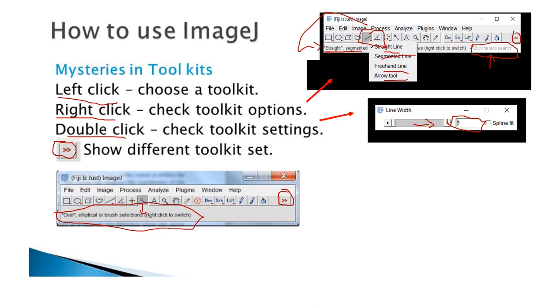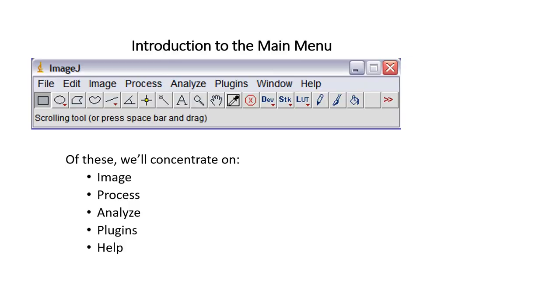Just go and try to play with it a little bit, and also watch the video tutorial to learn simple things. Later we will start doing more complicated stuff. In the main menu you will have the Image menu, which you will use a lot. Process, at least in the beginning, you are not going to use much. Analyze you are going to use to do some of the measurements and to set the scale. Plugins, at least in the beginning, you are not going to use either.